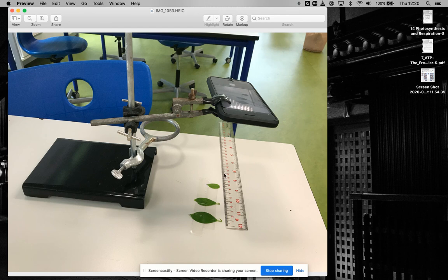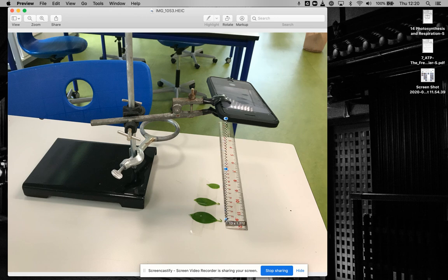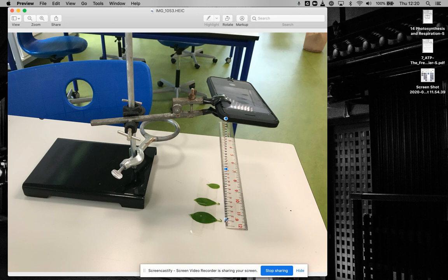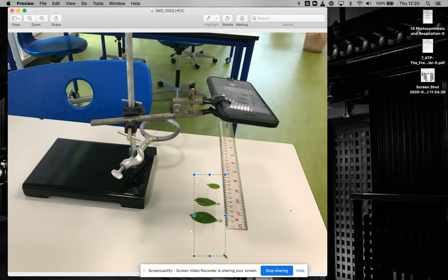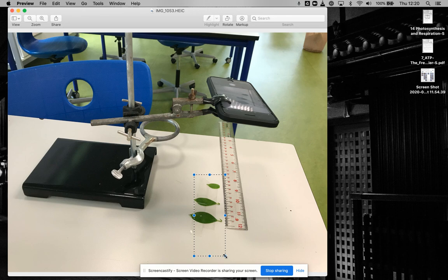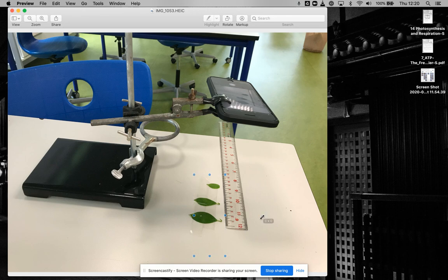The first thing you have to do is have a physical setup like this. You have the camera at a set distance away from the table, and you don't want to move that for reasons I'll make clear later. Down here you have your sample. In this case, I took some leaves and taped them to the table because they weren't perfectly flat, so I wanted to make sure I measured the area accurately.